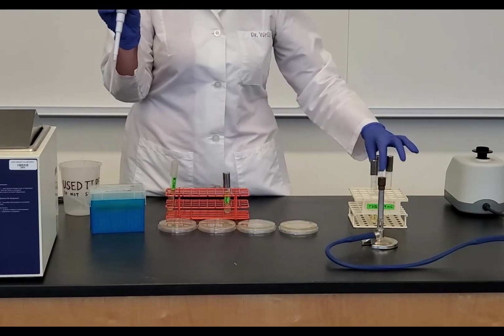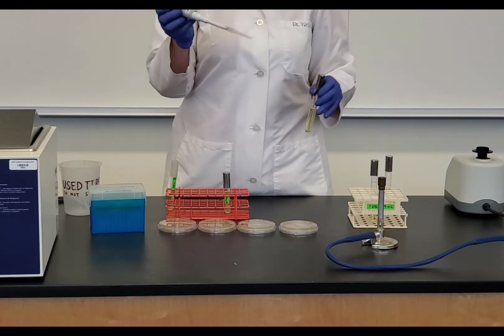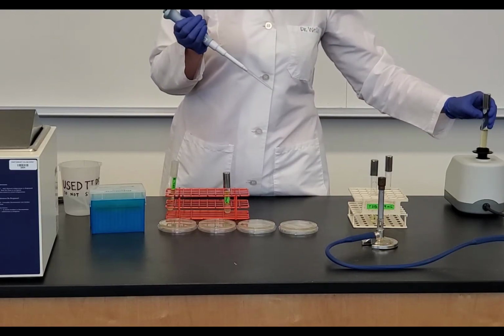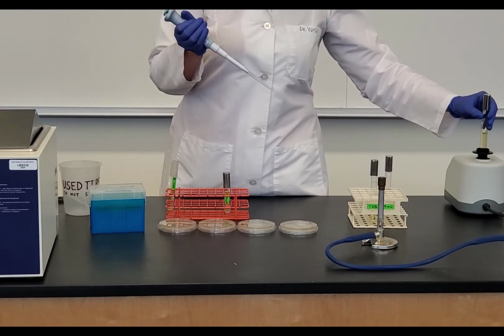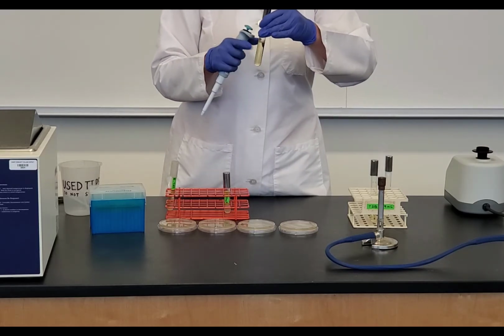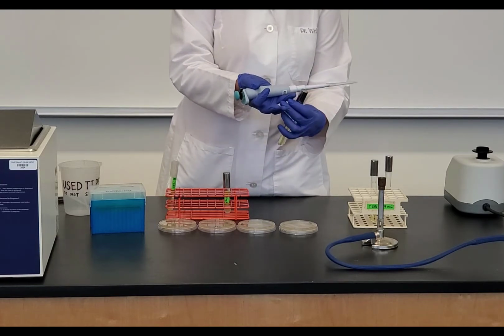So I get my next tip. Now I'm going to transfer from my 10 to the negative 4 into my 10 to the negative 6. So again, I'm going to vortex before I take any liquid out. I'm just going to give it a little hand vortex as well. Okay. And again, I'm going to go under my pipette.